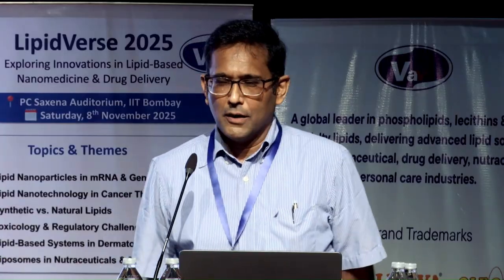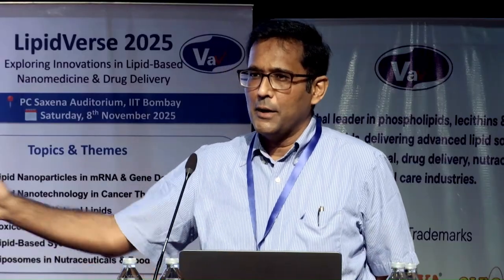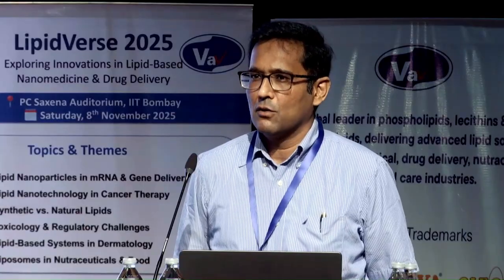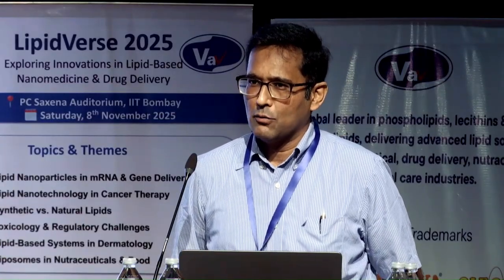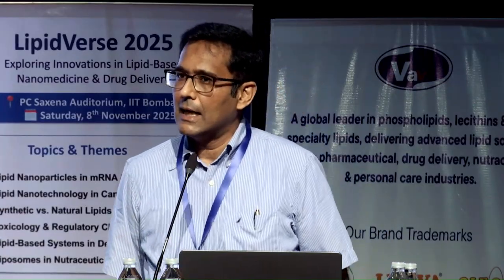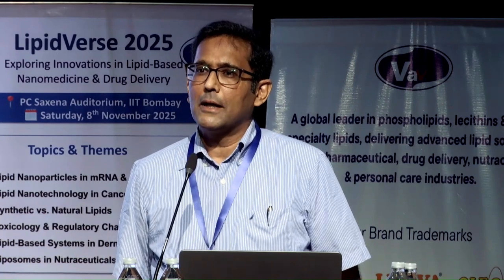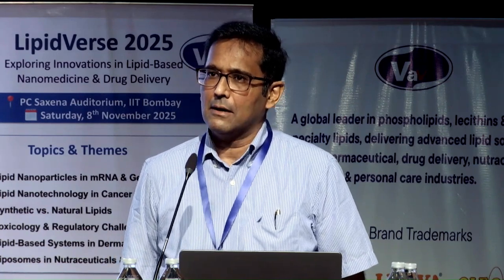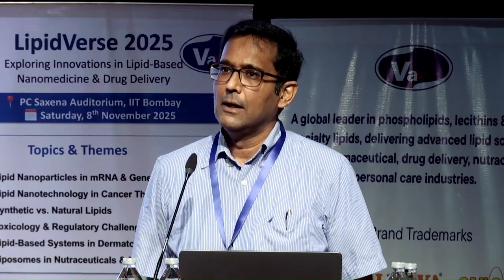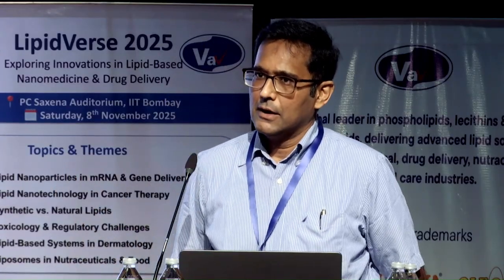It's a very good question. We have not done any of that. And I think the 300 nanometers that we are currently getting would probably be eliminated by the system itself. So we need to get it to 100 nanometers or below. We are very much aware of that, but we have not done any cell uptake studies. As engineers, we're looking at the process. And what we are hoping is, whatever the industry standard is, can we get to that using this particular method? That's what we are aiming at. Maybe the next step would be to do the cellular uptake and look at whether there is indeed an absorption.